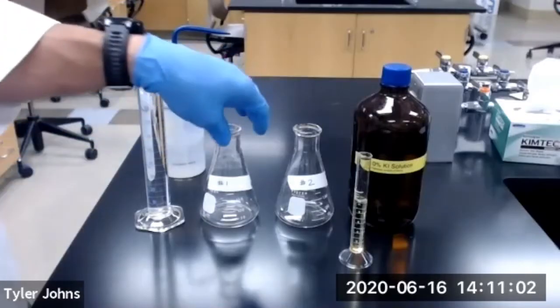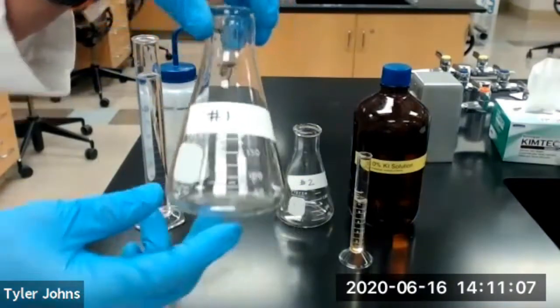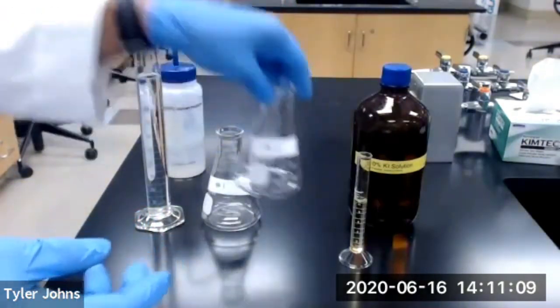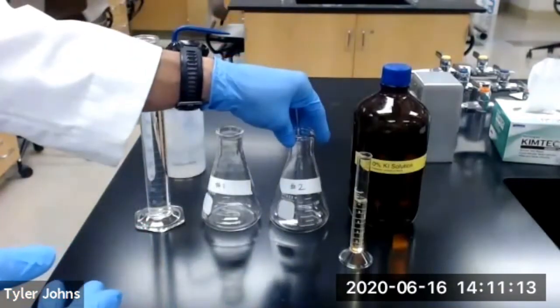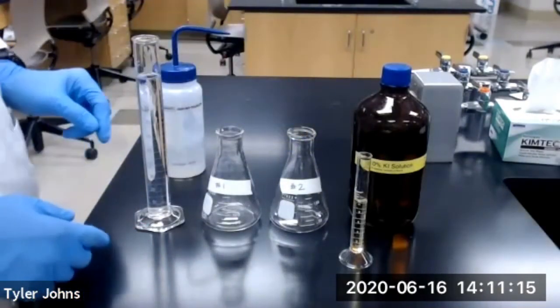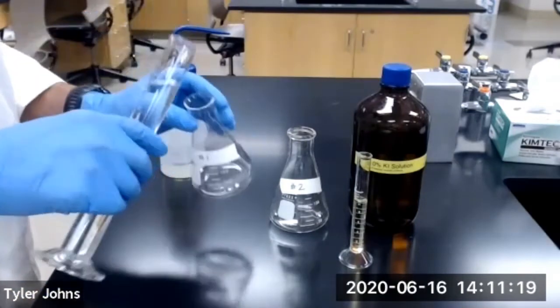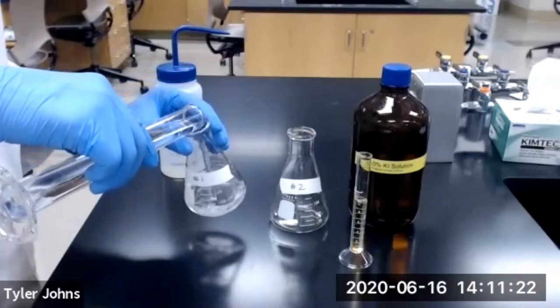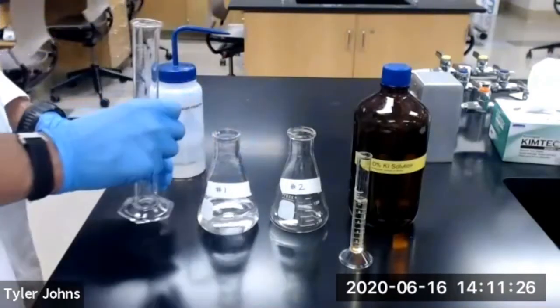Okay, so we first need to label 2 Erlenmeyer flasks, Erlenmeyer flask number 1, and Erlenmeyer flask number 2. We're then going to use a 100 milliliter graduated cylinder to add 100 milliliters of deionized water to Erlenmeyer flask number 1.